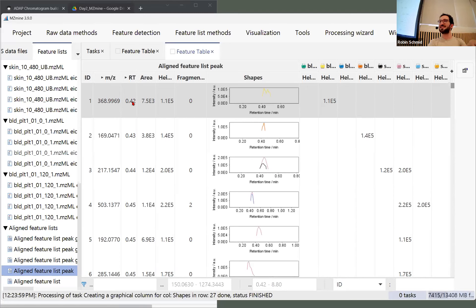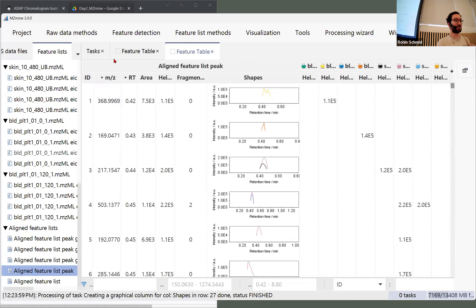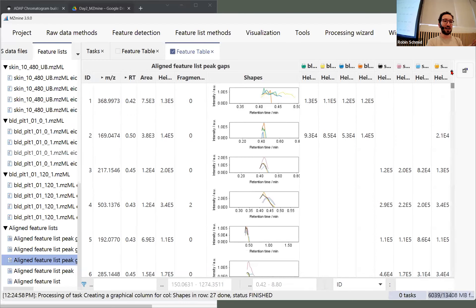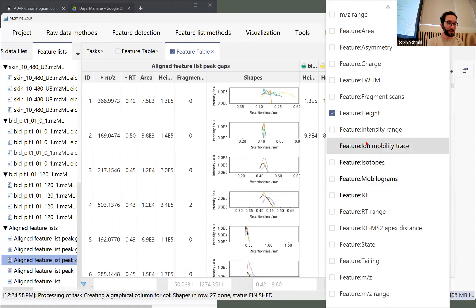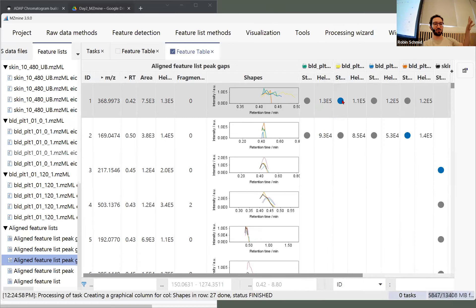Gap filling goes back into all the other files and tries to find the m/z and retention time range. If there's some intensity I'd rather see it than not have it. There's debate about whether gap-filled data is comparable statistically, but personally I think the statistical analysis suffers more from all those missing features that are genuinely there. High-resolution mass spec has a very narrow window to extract intensities, so if there's no signal there's nothing — it's not going to pick up much noise.